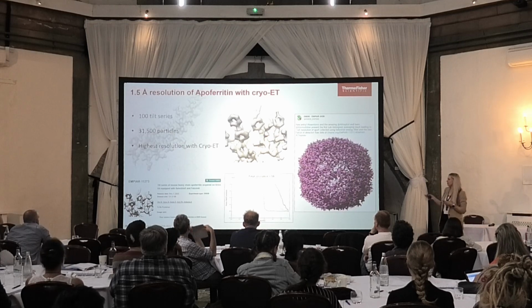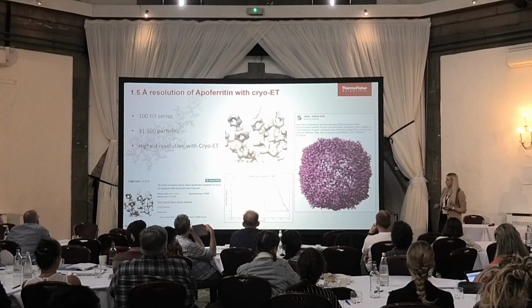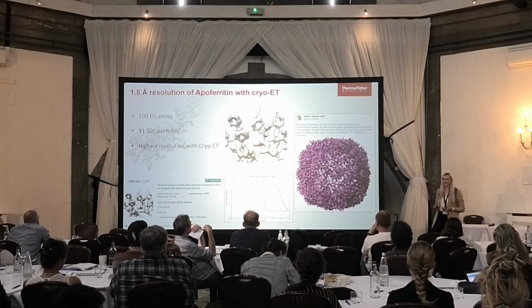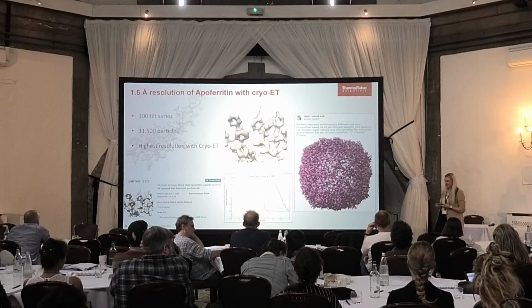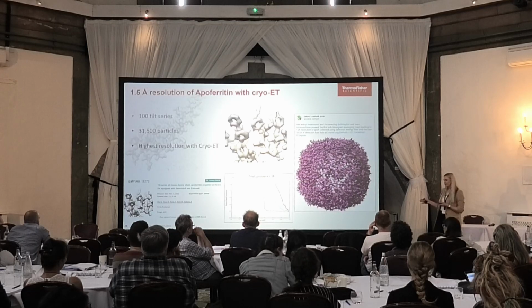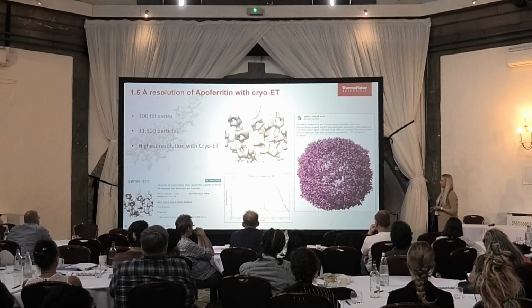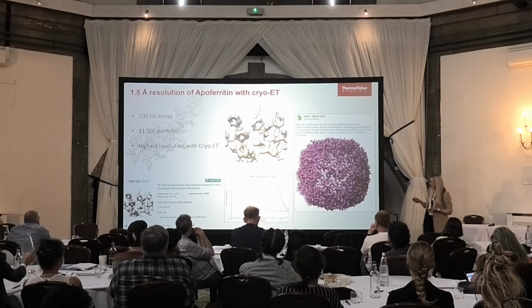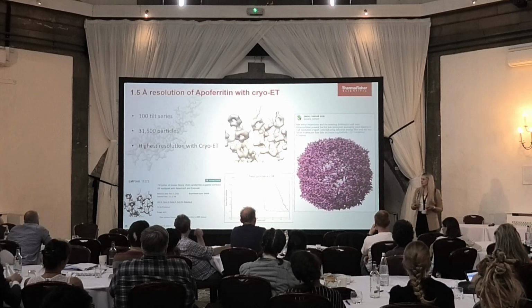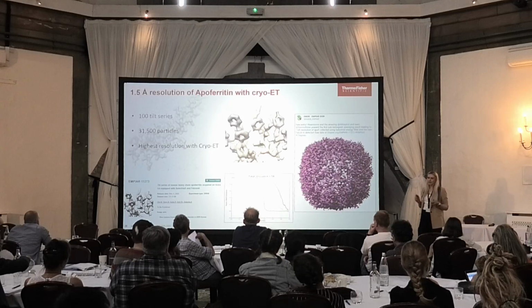So whilst we don't need another apoferritin reconstruction, I think this was a really neat experiment to say that if you are, particularly if you're using our hardware and the processing solutions that are out there, those will not be the limiting steps in your experiment. It will most likely be the sample. And of course, this data set is available at EMPIAR, so if you would like to practice processing or practice some other things, you can download it yourselves.